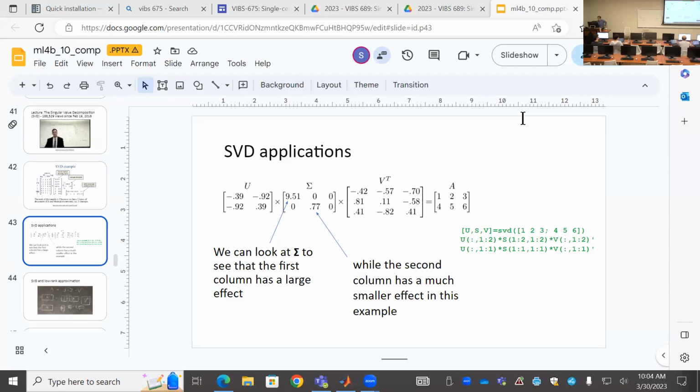So this week, we are going to revisit our numerical examples in matrix decomposition, especially in SVD. And then we also will have an introduction to spatial transcriptome analysis. So let's start with the small example we used in the lecture.